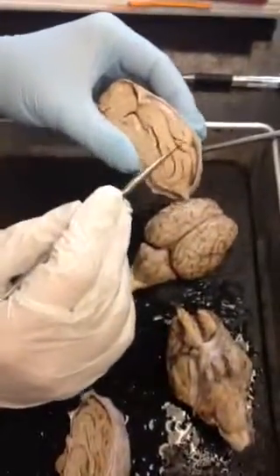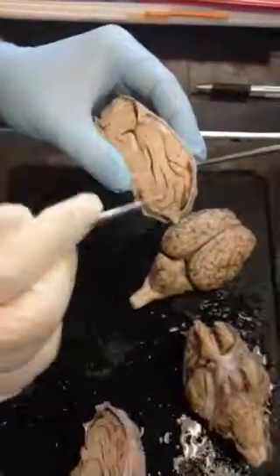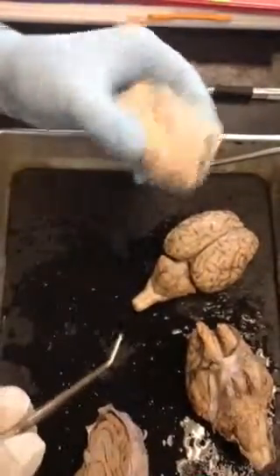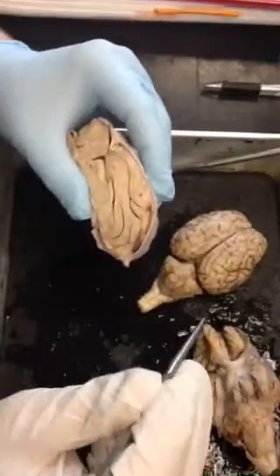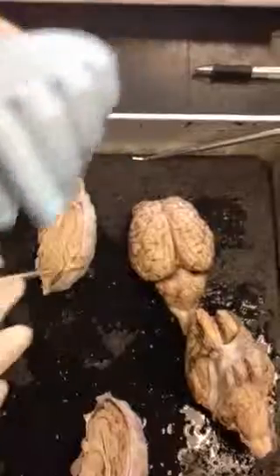The coloring's not real good on here, but it's the gray matter that surrounds the whole top layer. So it's like a thin layer of gray matter that goes around. That's the cortex, right? So what are the gyri and the sulci? What are those? What are the gyri?